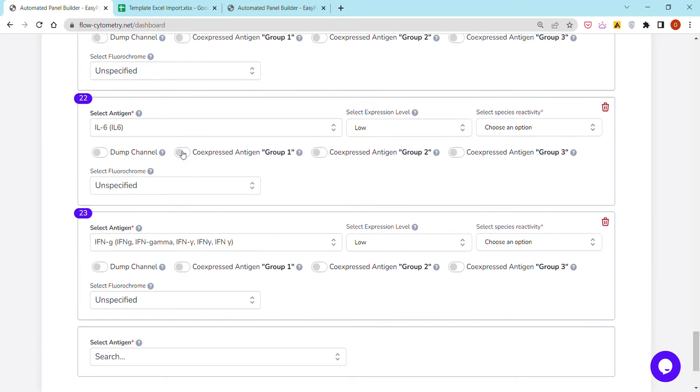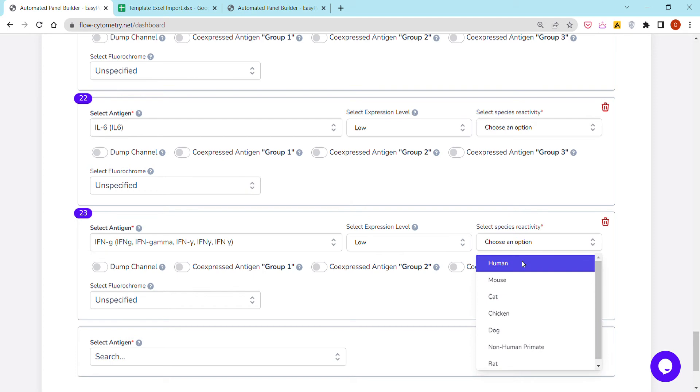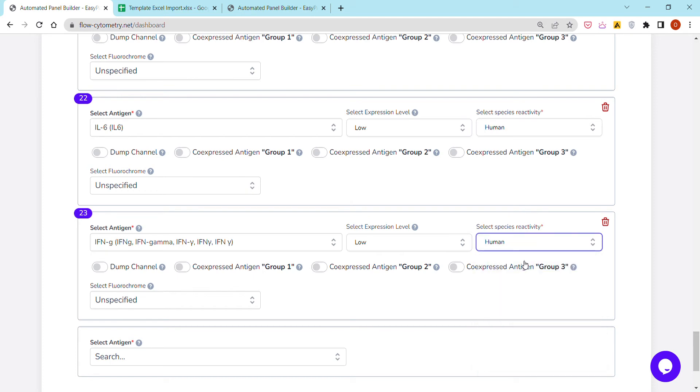These are the names of the antigens. We have to choose the species reactivity, so I'm going to go with human, and then these are a few different options and functionalities.